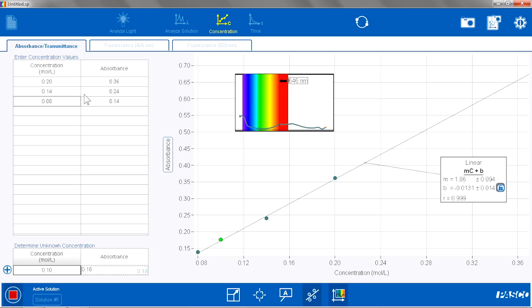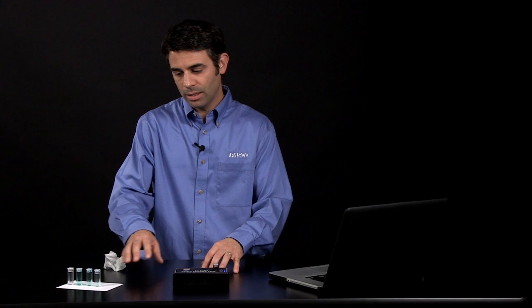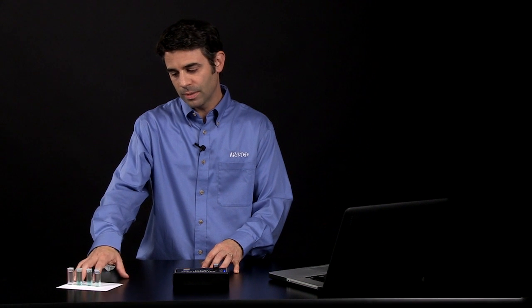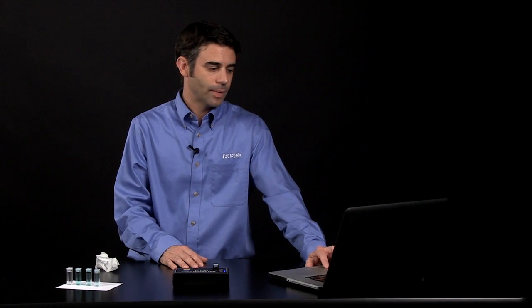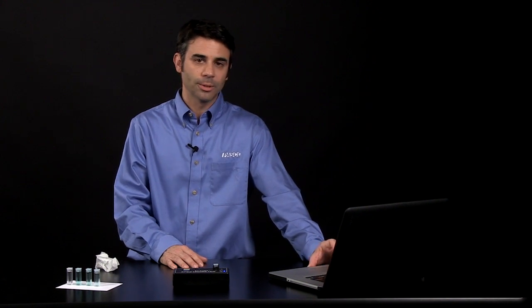But pedagogically appropriate, it allows them to create the curve based on the standards, to analyze an unknown, and there has to be some work on the student's part to figure out what the concentration of that unknown is. And they get some feedback using the software.